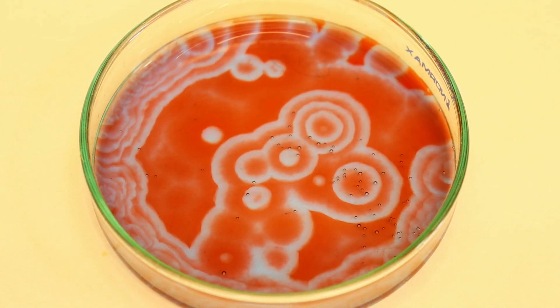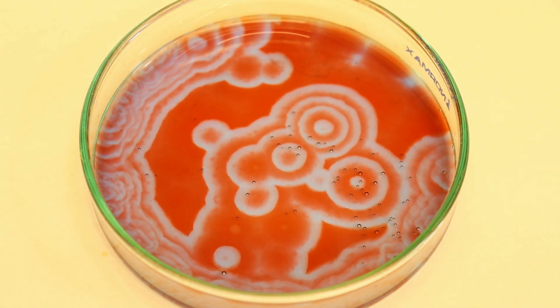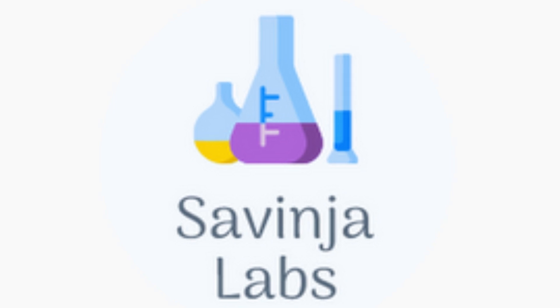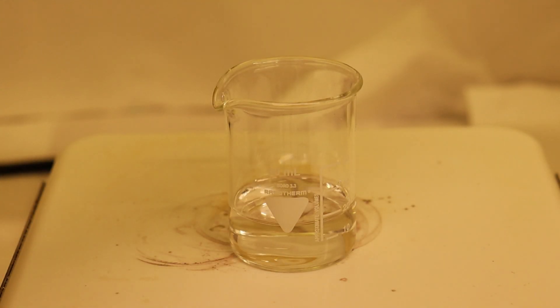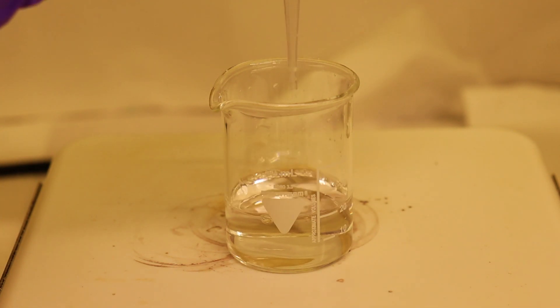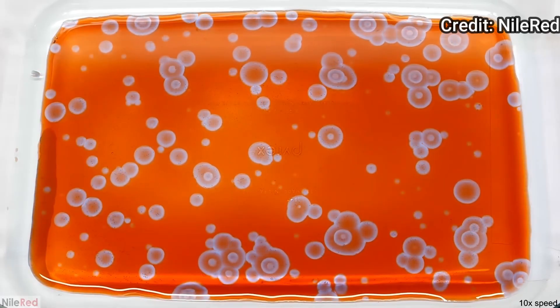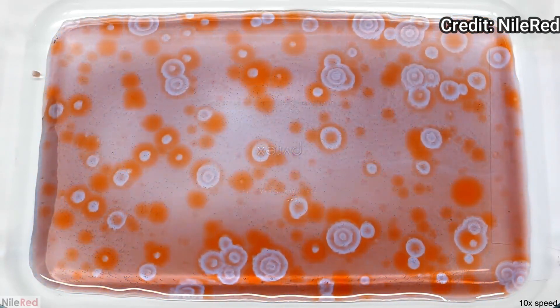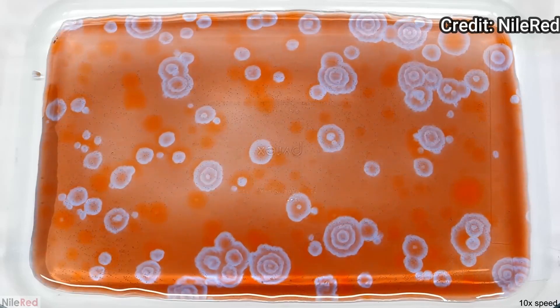So we decided that we will make this video about the reaction that kind of looks like it is magic: the Belousov-Zhabotinsky reaction. We wanted to do this reaction for quite a long time now. Ever since we saw it on Nile Red's channel we knew that we should give it a try. It looked like it was magic and it was definitely the weirdest and one of the most beautiful reactions that we ever saw.